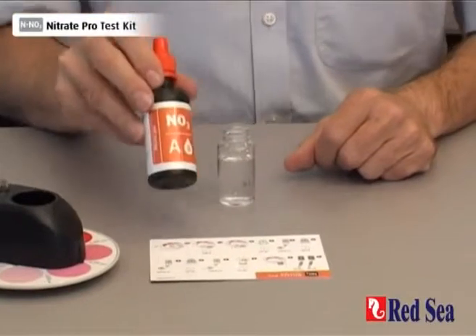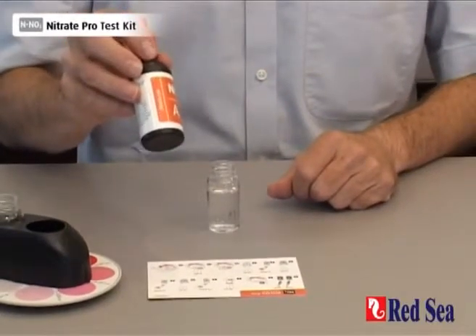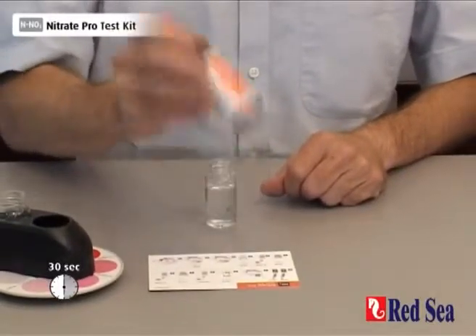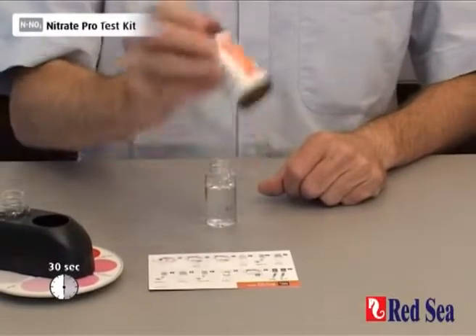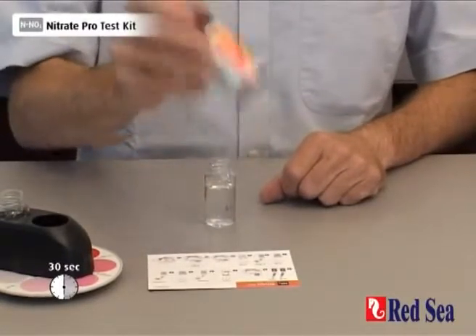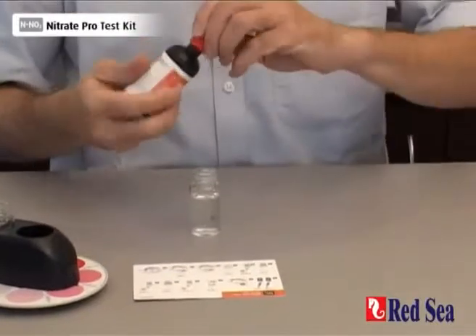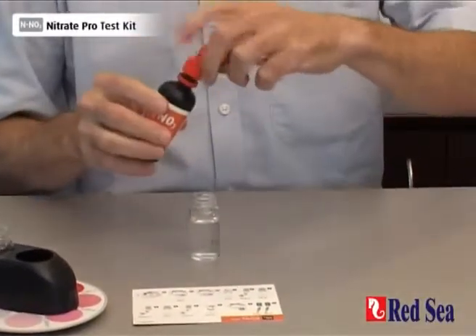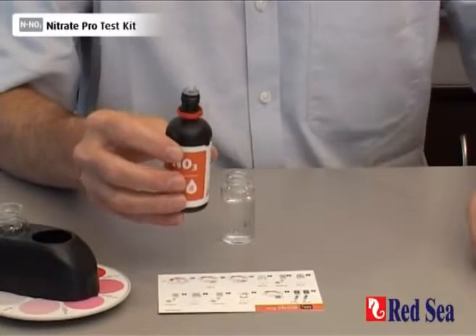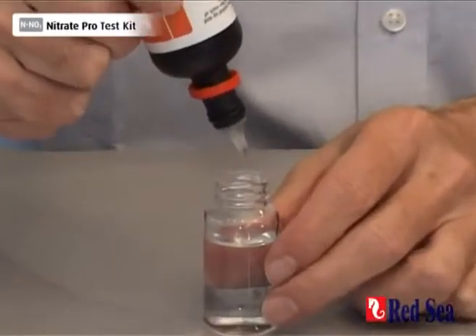We first need to take Nitrate Reagent A. What's important is to shake this very, very well for at least 30 seconds. Now we're going to quickly put eight drops into the vial. The purpose of the shaking and the speed is because it's a suspension, and if we don't do it quickly enough, the reagent will not work properly.